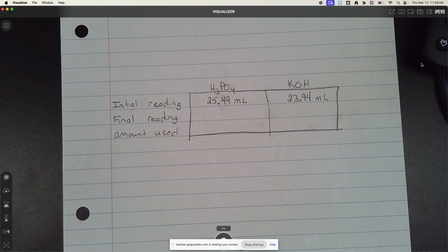You know from drops on a penny that there's about 20 drops in a milliliter. I am about 1/20th of a milliliter over the line. That's not really a huge percentage when you consider that I started with a little more than 10 milliliters of acid, and I've used a whole bunch of base. That's part of the advantage to using a slightly larger number: the one drop it takes to turn it color is a much smaller percentage of the overall total here. Okay, so we've achieved having it be basic.